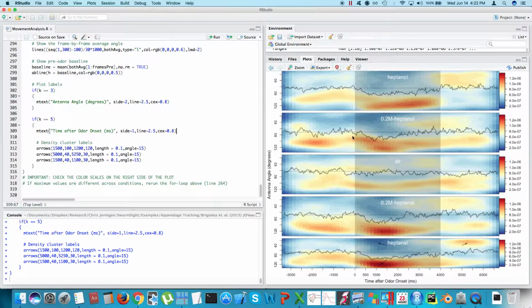You can see this also in the diluted version. We don't see the same thing in the air, so we can see that this is not just some sort of artifact of perhaps just air.